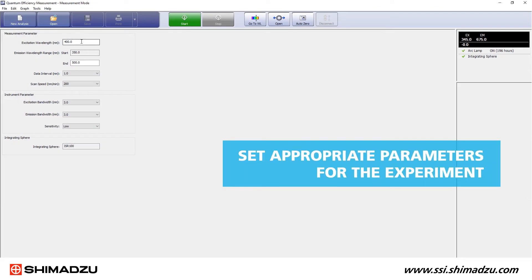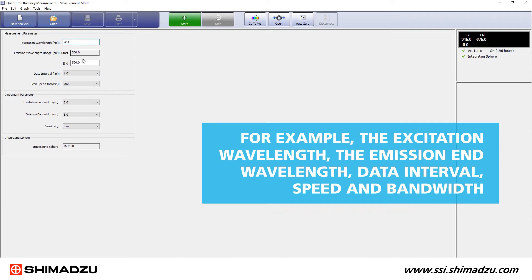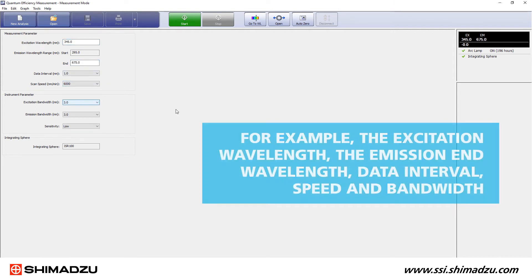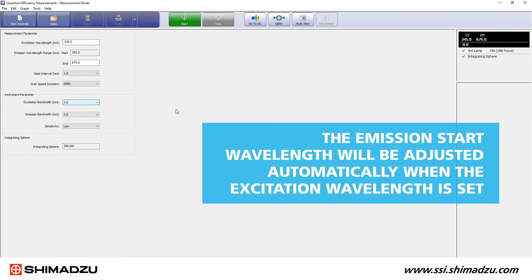Set appropriate parameters for the experiment — for example, the excitation wavelength, the emission end wavelength, data interval, speed, and bandwidth. The emission start wavelength will be adjusted automatically when the excitation wavelength is set.